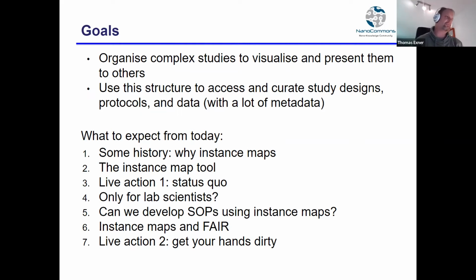We will have some examples today of how we show that. Just: this is the study I'm doing, these are the different parts I need, is that okay? You could go to your colleague or your supervisor to present that, or perhaps in publications.